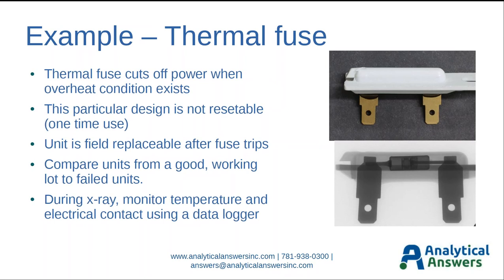I really like this next example. This is an example of a thermal fuse. It plugs in on these spade connectors and if we look at the X-ray inside we can see the mechanism of the fuse itself. This particular design is one time use only, it's not resettable, but being connected easily with those spade connectors it is field replaceable even though it's only one time use. We're going to compare units from a good working lot to units that were causing issues with the equipment in which they were installed. During the X-ray we have a heater inside the X-ray machine that we use to increase the temperature at a controlled rate and we also use a data logger to measure temperature and electrical continuity through the device.